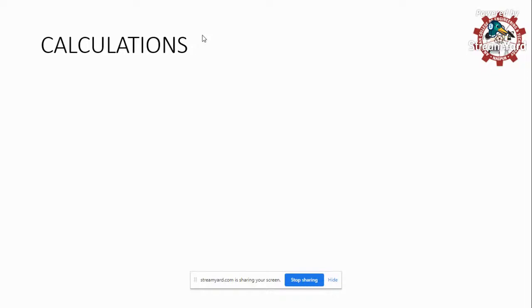the bomb is made with authentic stainless steel. One more thing I will say here: the bomb calorimeter is very costly. It costs about 50,000 or more. It is instrumentation, so it is very costly. And it is not as simple as it looks. We are just telling you on the basis of a small diagram. But when you do it practically, it is really very tedious and requires meticulous performance. Okay, clear?